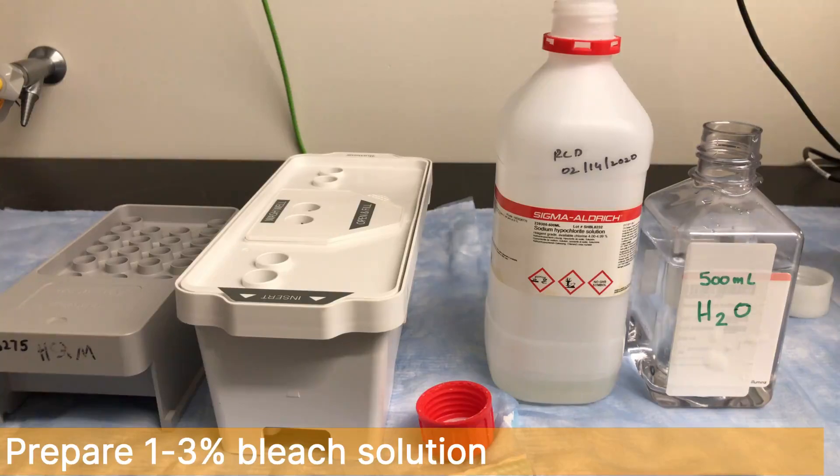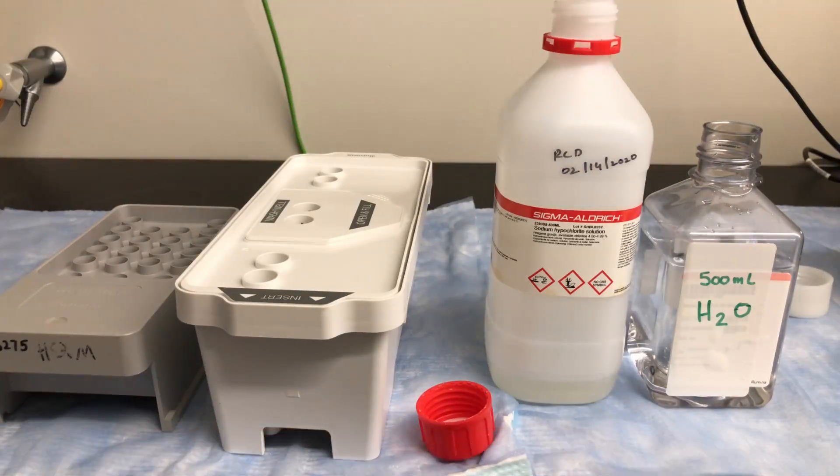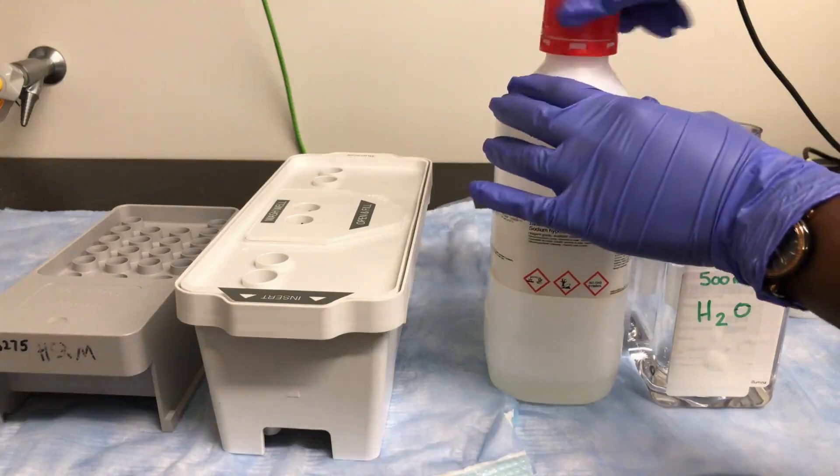Prepare a 1–3% lab grade bleach solution to fill the wells of the tray. Pure sodium hypochlorite is recommended.